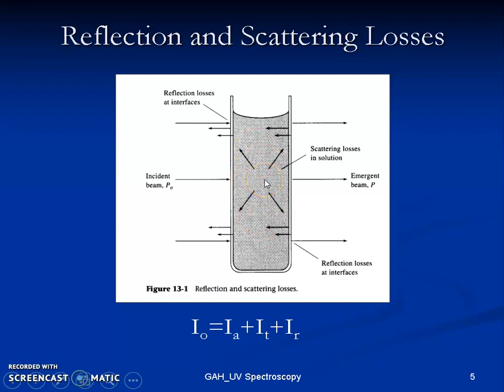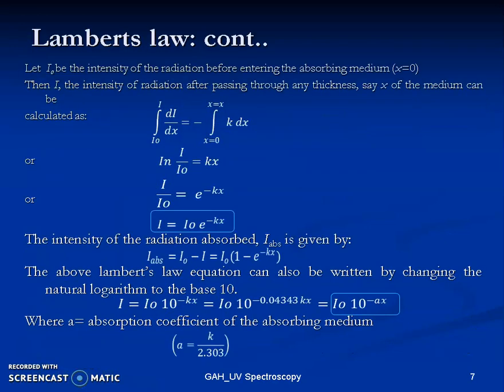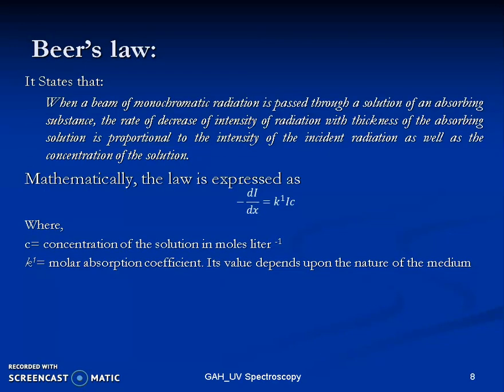So basically he has extrapolated Lambert's law and made his law called Beer's law. We always call this the Beer-Lambert law because both the thickness and the concentration terms have been taken for any discussions we have hereafter. So coming to the definition, what does Beer's law state?